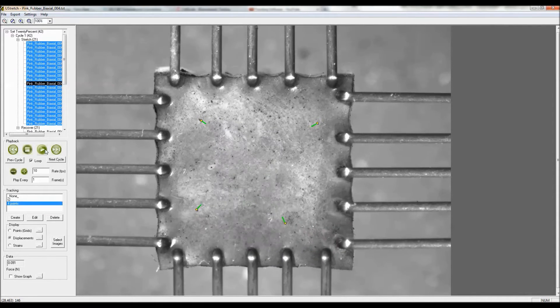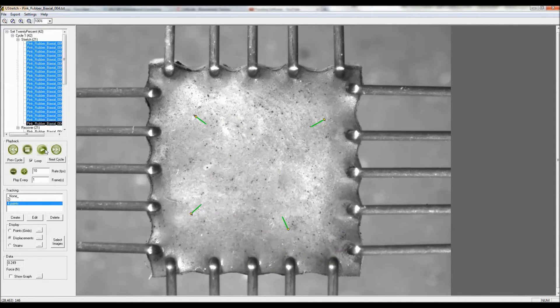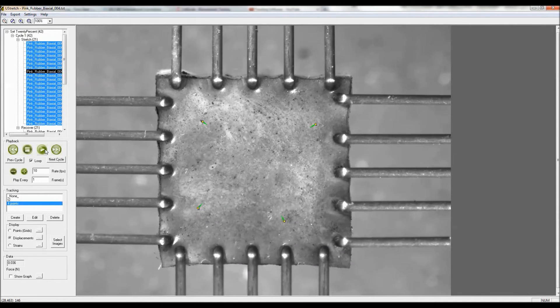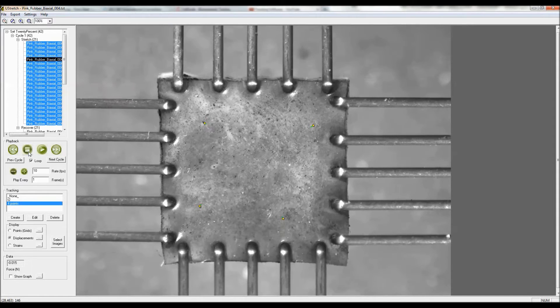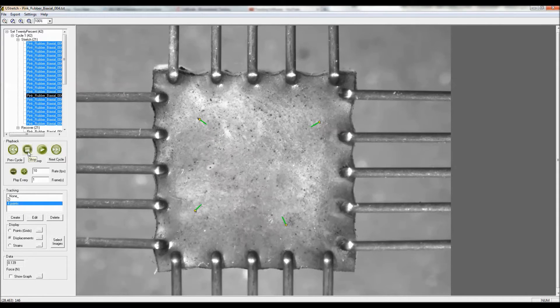And here you can see the trace history of those points as they move while the specimen is being deformed.